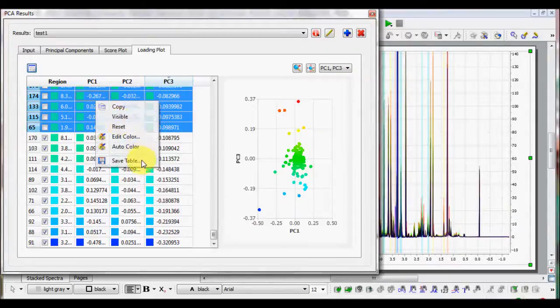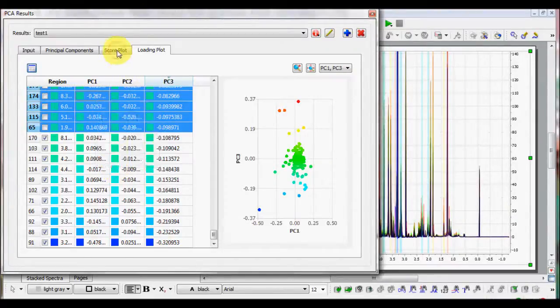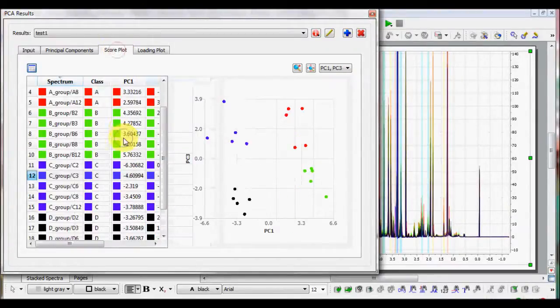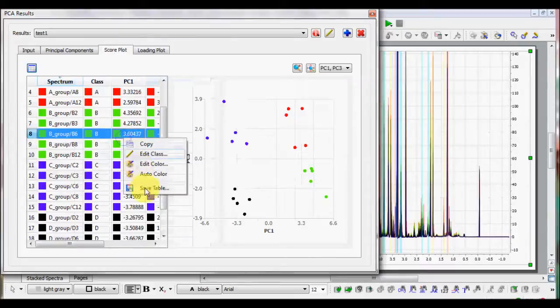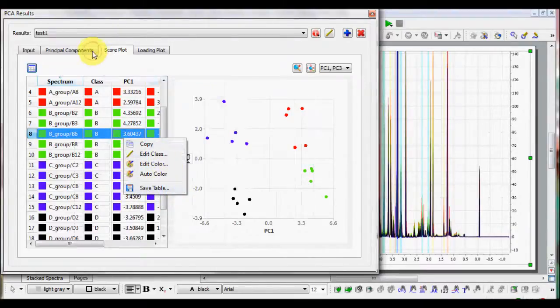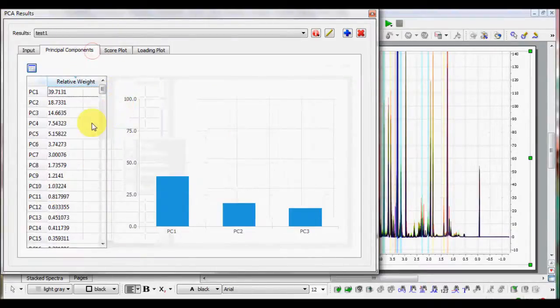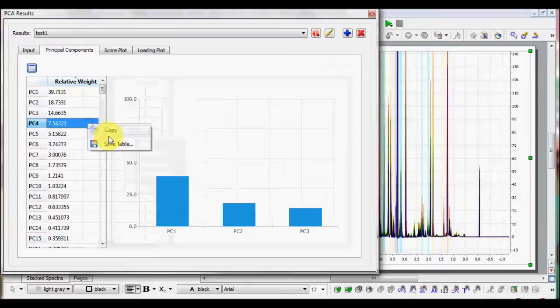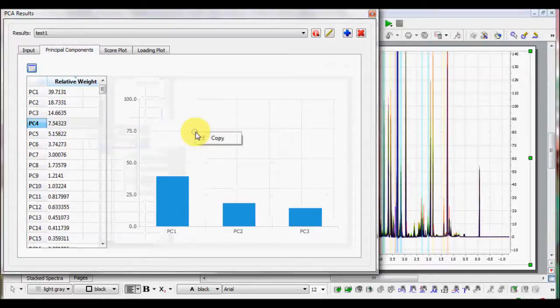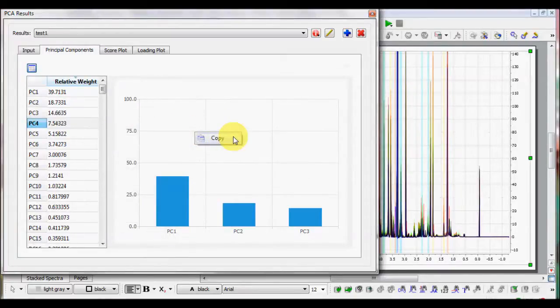All the tables could be copied and pasted into a spreadsheet or directly exported as an external file. All the graphics could be also copied and pasted to whatever Office program.